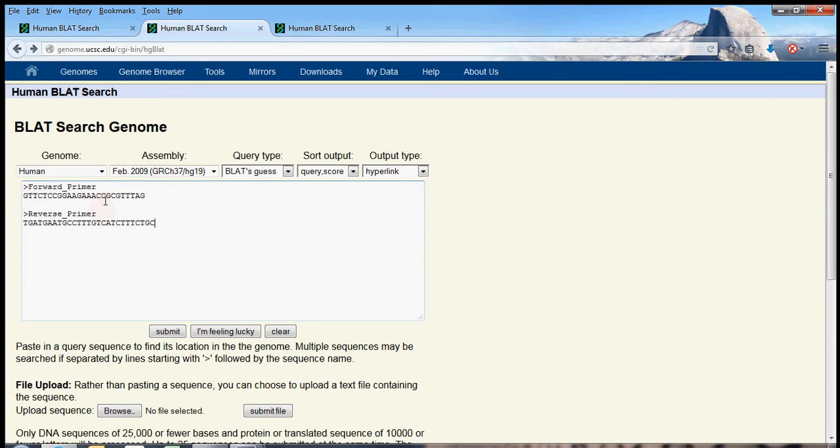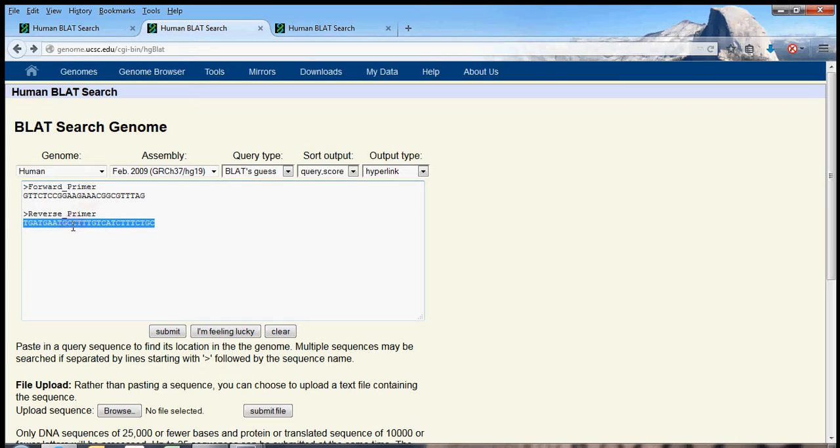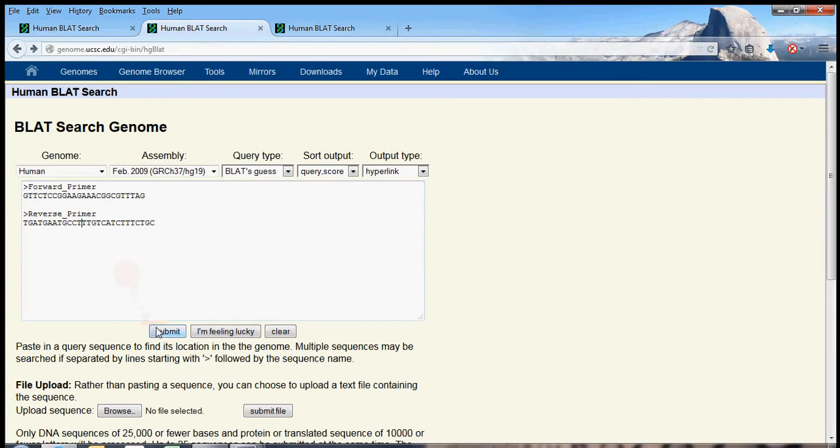These happen to be primers that I've used in real life to amplify a piece of RNA into DNA. So you'll see that the primers are long enough, they're longer than 20, so BLAT will be able to find them in the genome. And there are two of them because primers for PCR, by the way, polymerase chain reaction, primers tend to come in pairs.